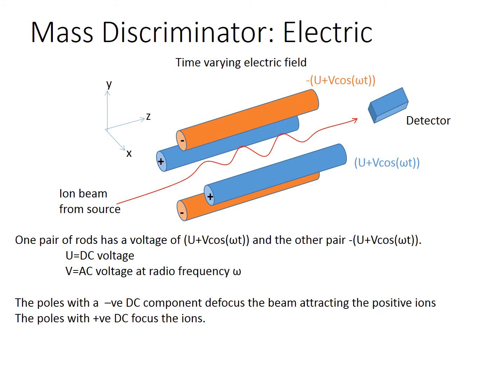But then if we think about the alternating charges, with this pole here, we're pushing stuff towards the middle, but if the alternating current is big enough, it's going to start superimposing occasionally negative charges on this positive charge. So it's going to start to accelerate ions away from the middle. And it will do that faster for the lighter ions because they've got less momentum, so they get more easily dragged out to the sides. So if you just look at these, this will only allow the heavier ions through because the lighter ions will get wiggled out towards the sides.